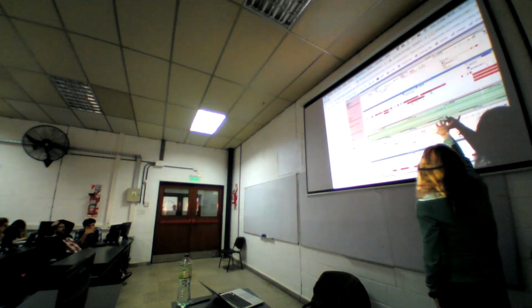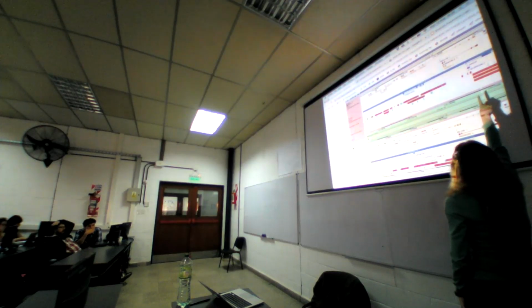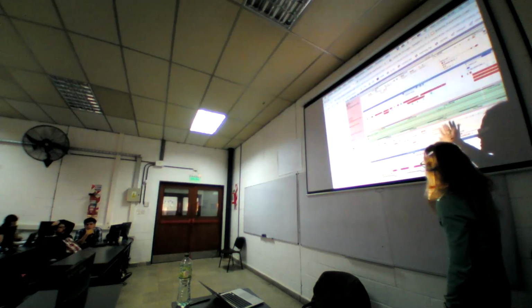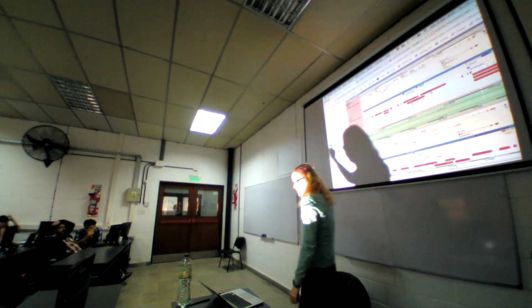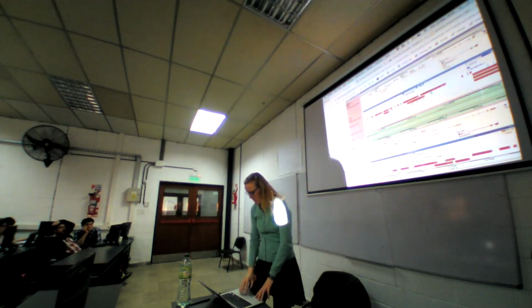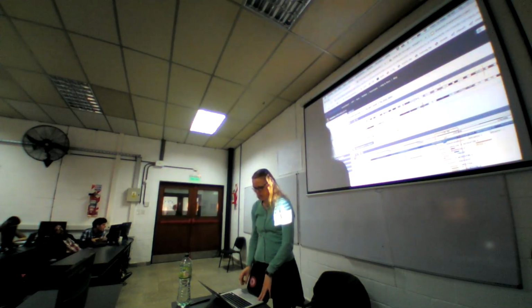They're connected by green blocks, and you can see there are some gaps in between human and mouse in the alignment, and also the gene annotation in that region is quite different. I think that's what I wanted to show here for the alignments.